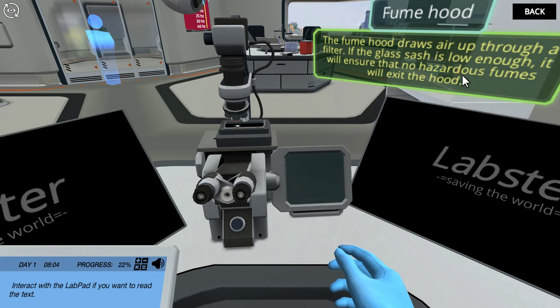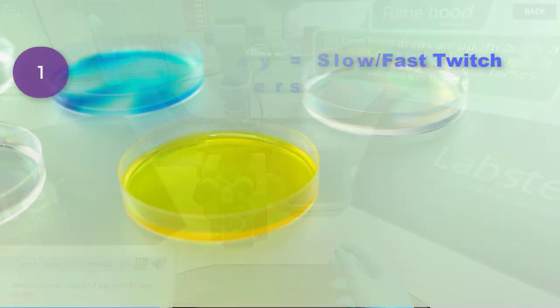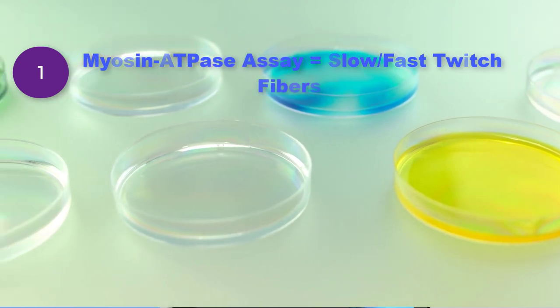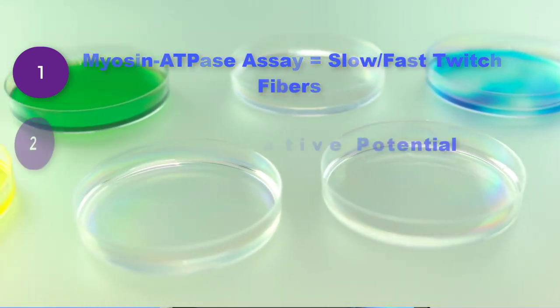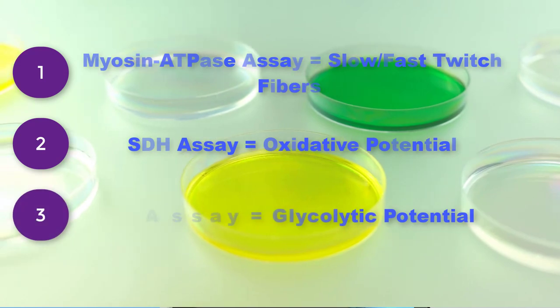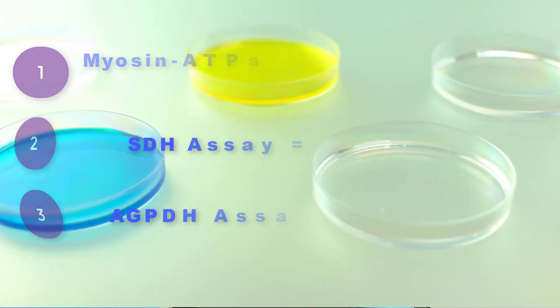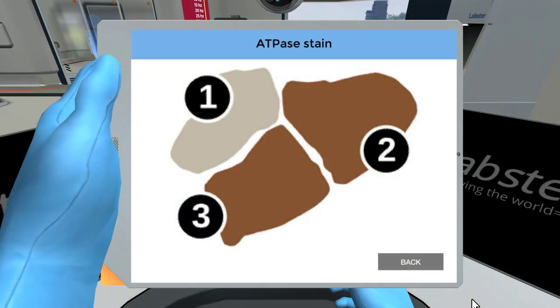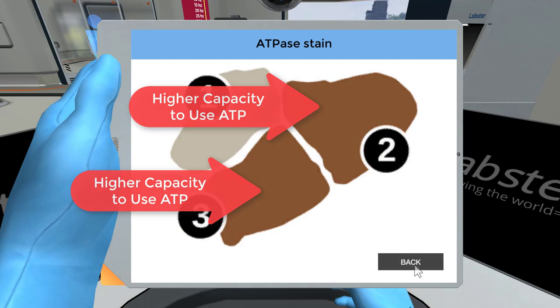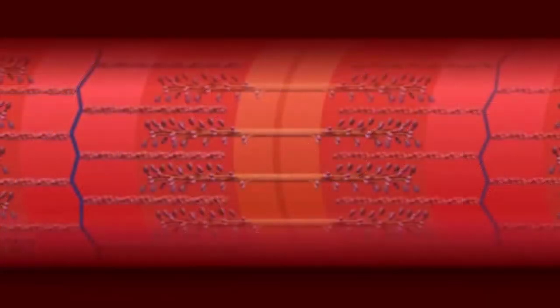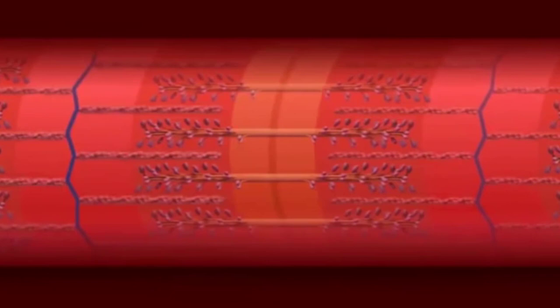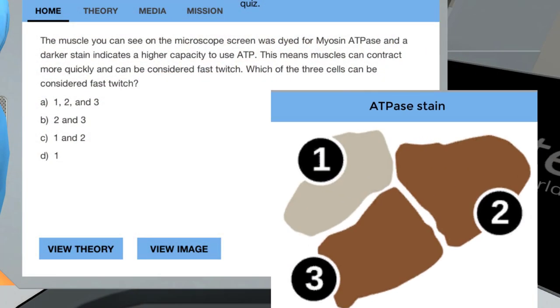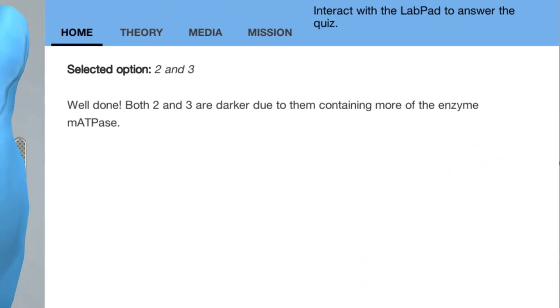Today we will focus on three histochemistry assays: 1. The myosin ATPase assay for slow or fast twitch fibers. 2. The SDH assay for oxidative potential. 3. The AGPDH assay for glycolytic potential. The muscle you can see on the microscope screen was dyed for myosin ATPase and a darker stain indicates a higher capacity to use ATP. This means muscles can contract more quickly and can be considered fast twitch. Which of the three cells can be considered fast twitch? Well done! Both 2 and 3 are darker due to them containing more of the enzyme myosin ATPase.